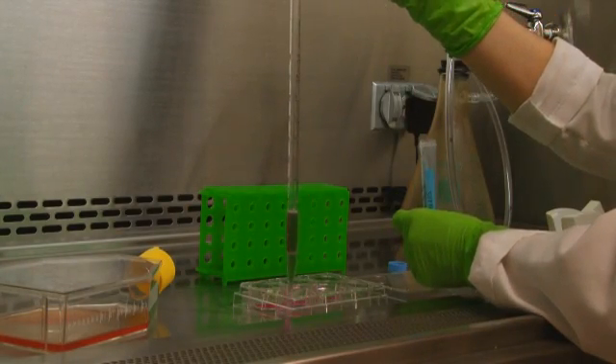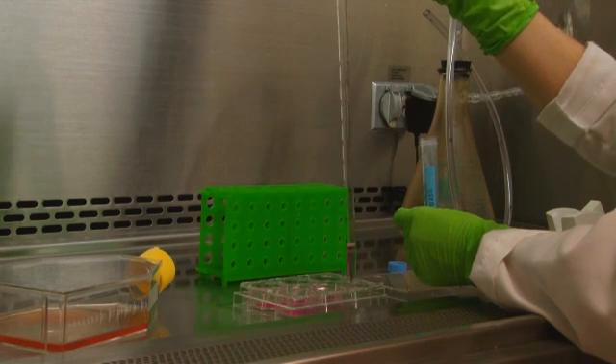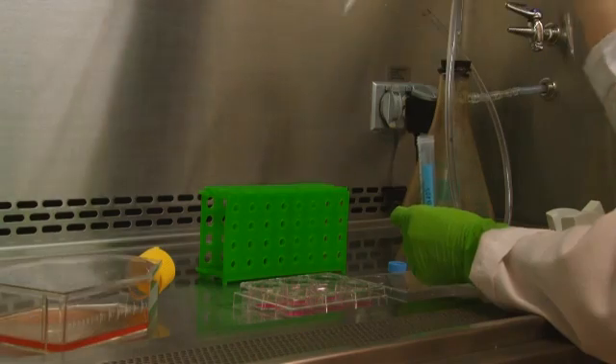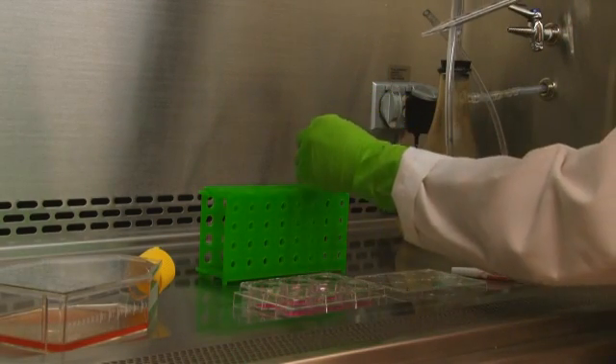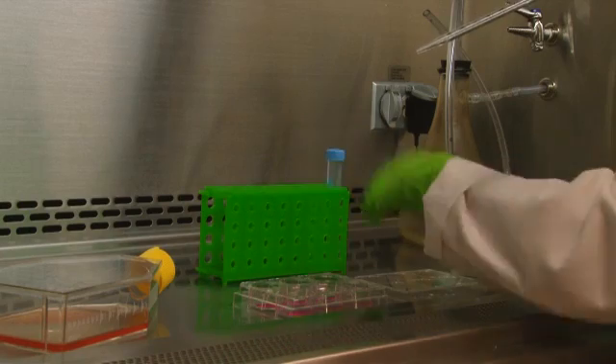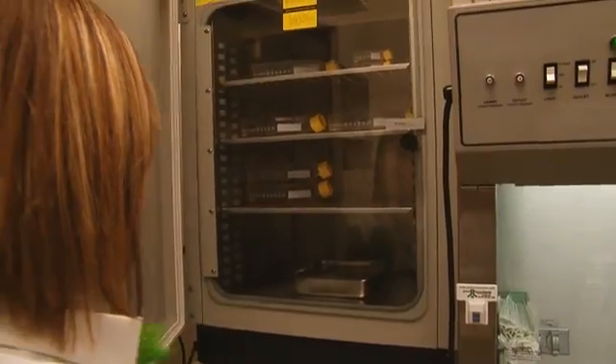With clean cover slips prepared in 6-well plates, we can now add our cells. Plate adherent cells at a density of 1.5 million cells per well. Cells are then cultured overnight in the incubator or until they reach your preferred density.